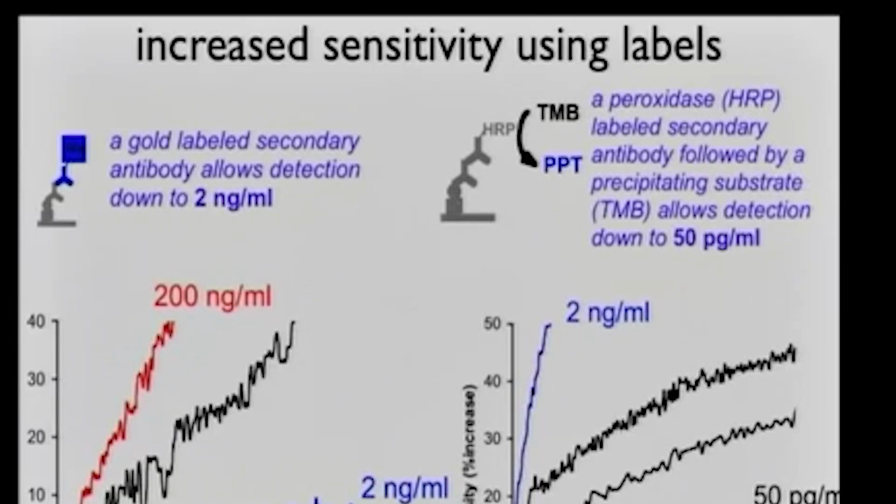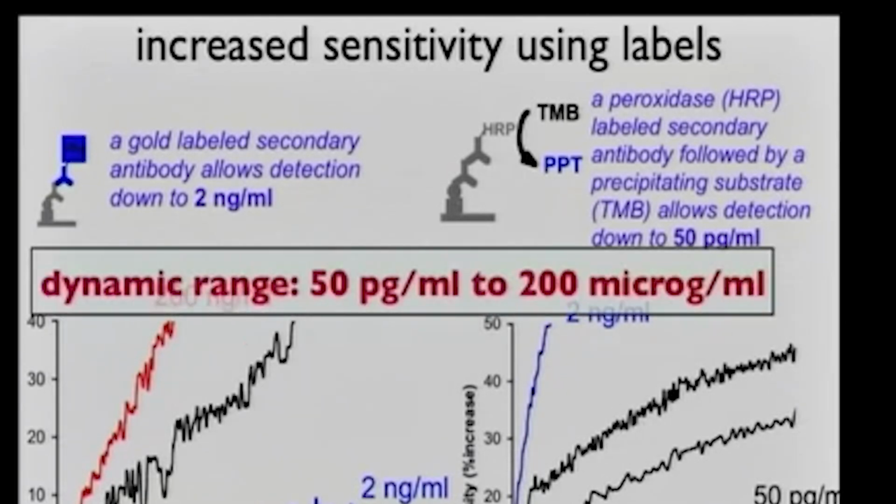I think one can actually even tweak it further, but you're starting now to fight kinetics because if the concentration is very low, this binding takes a very long period because it takes some time for them to find each other. But anyway, this could be useful when we are talking about very weak protein-protein interactions or different types of analytes which are in very low abundance.